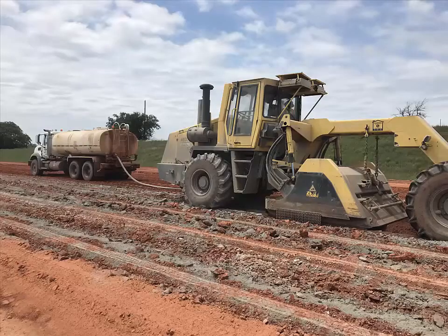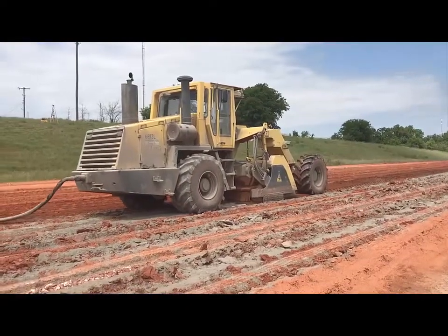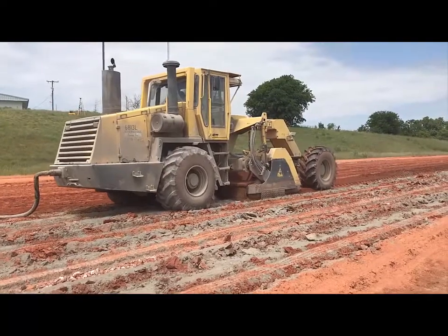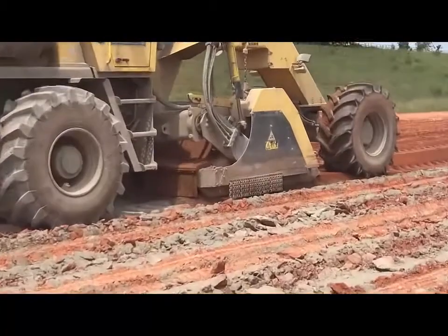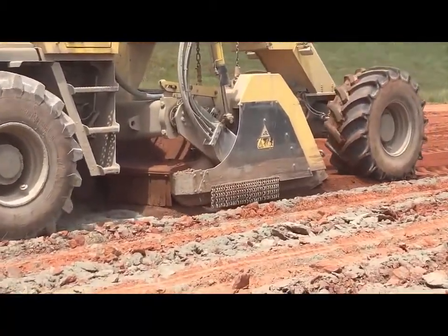But in order to speed the process up and help inspectors on site and help contractors get that site as stabilized as possible, we wanted to look at the portable X-ray fluorescence technology. That requires understanding how to process the soil and testing it right there in the field, and we've been doing work on this for a while.